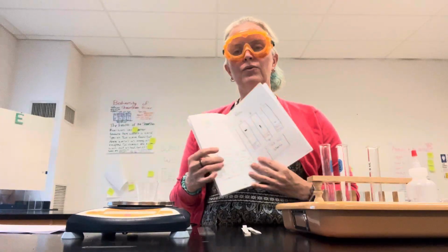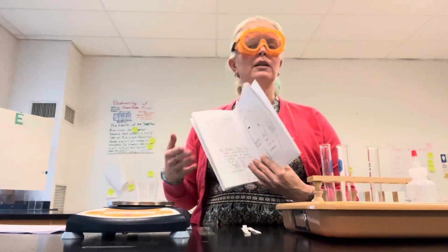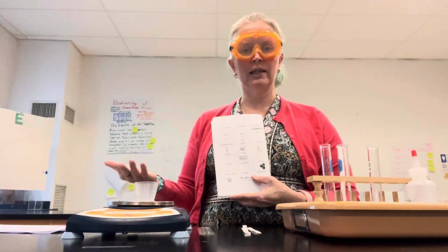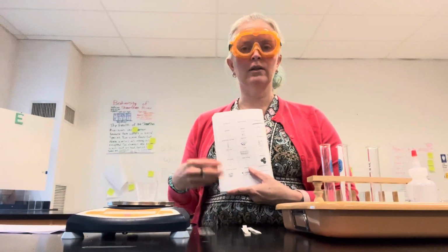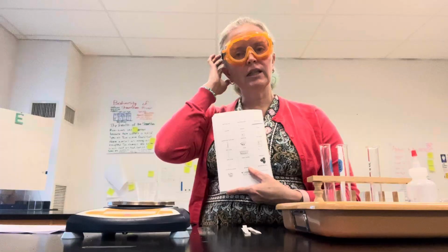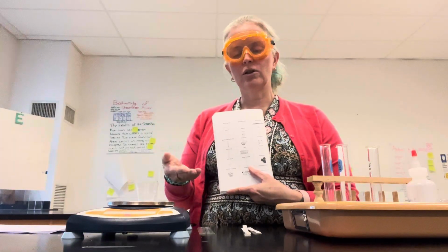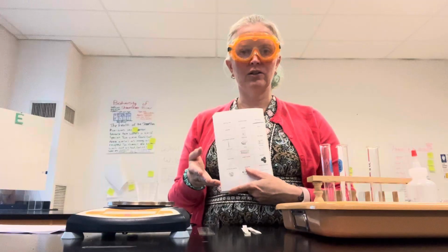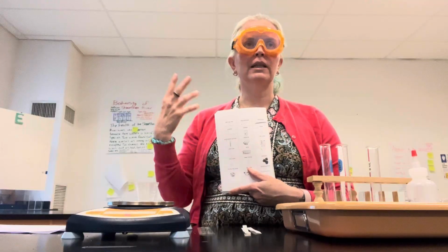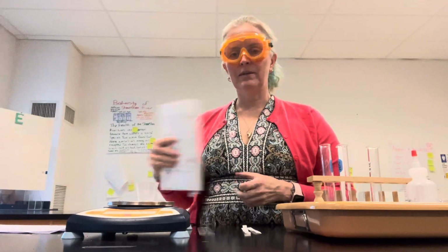And then for reasoning for this lab, you want to explain like the process that we use to separate the inks and how you know that this ink matches the other one. So give a little bit more detail. Pretend you're explaining the conclusion to somebody who doesn't know anything about the lab. A lot of times crime scene investigators are actually called into court to testify, and they have to explain in their own words and in what are called layman's terms how they know that the evidence matches the suspect. That's what I want you to do in this case.